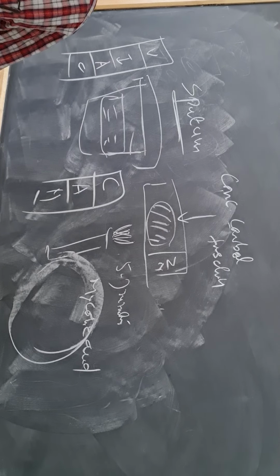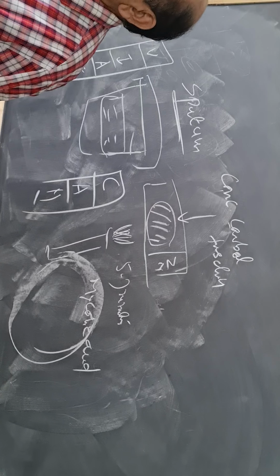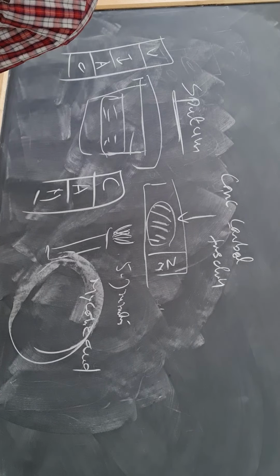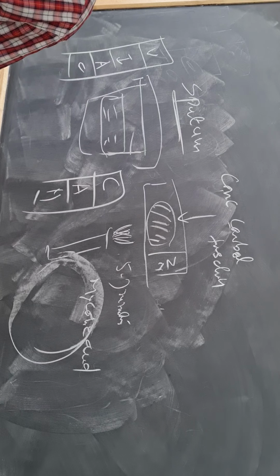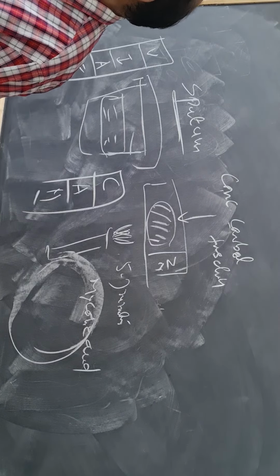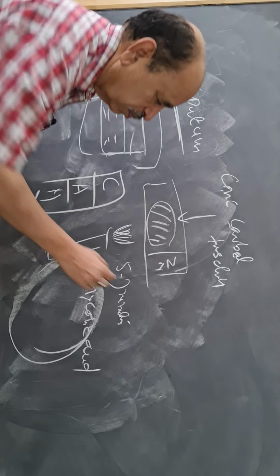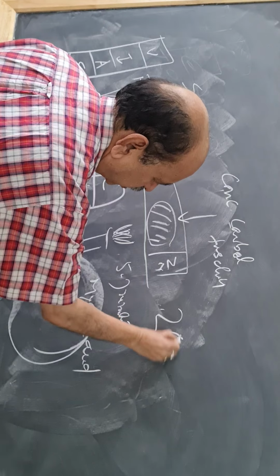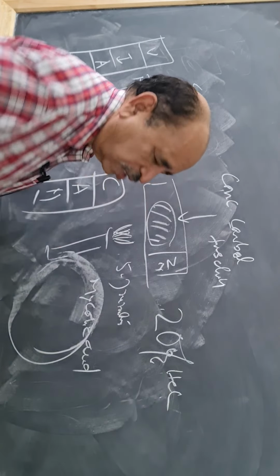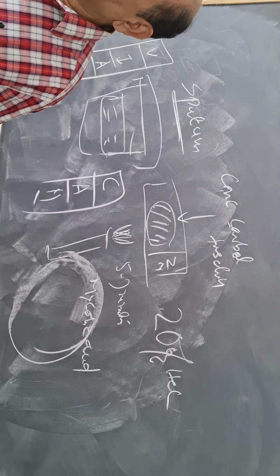You have to intermittently heat it from beneath for 5 to 7 minutes, taking care not to burn, char or break the slide. Then decolorize with 10 to 20% either sulfuric acid or hydrochloric acid, drop by drop, until the faint color remains.